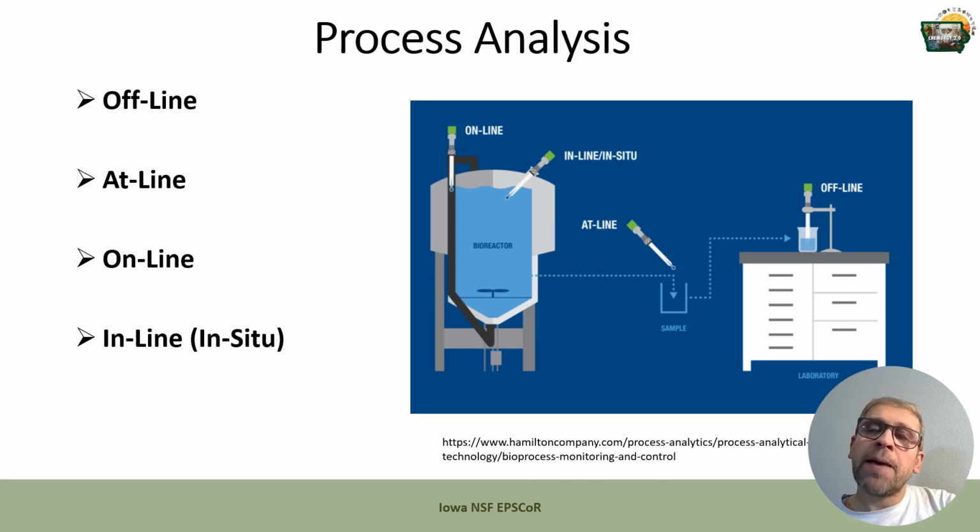In at-line sampling, we take some samples in the process stream and then try to do experiments in a shorter time than offline sampling. But the challenge still remains.